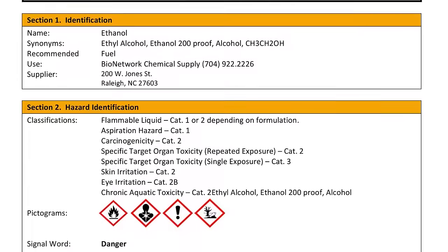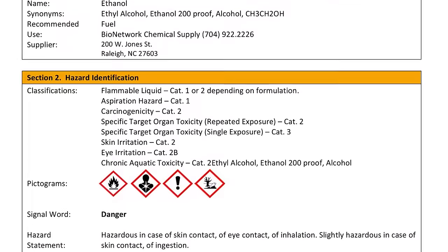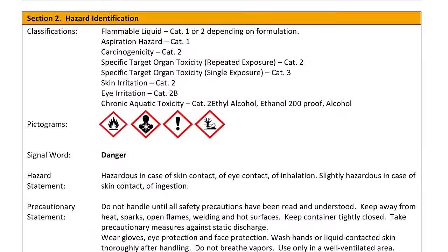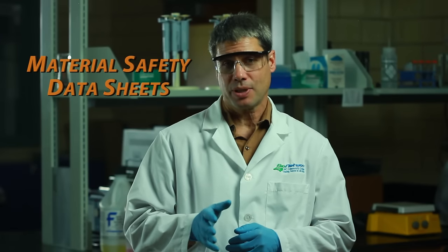Every chemical in the lab is required to have a technical document called a safety data sheet or SDS, usually provided by the manufacturer. These were formerly known as material safety data sheets or MSDS.